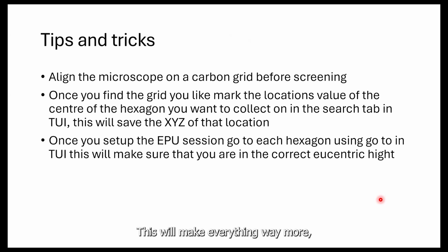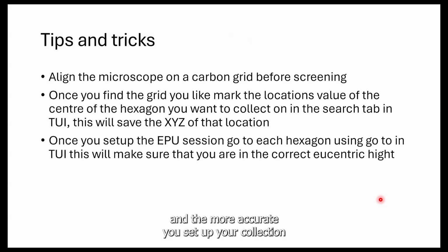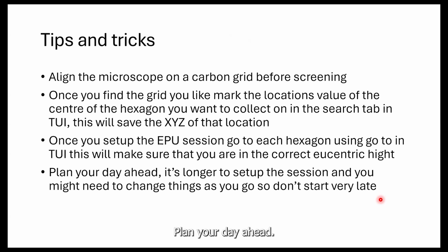This will make everything way faster and way more accurate, and we all want fast and accurate data collection. The faster you set up your collection, the more movies you can collect, and the more accurate you set up your collection, you can actually collect instead of just sitting there trying to fix and going back and forth with settings. Plan your day ahead. This is something I keep saying to my users.